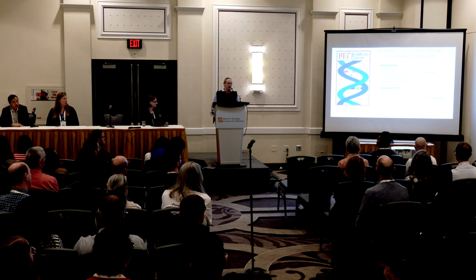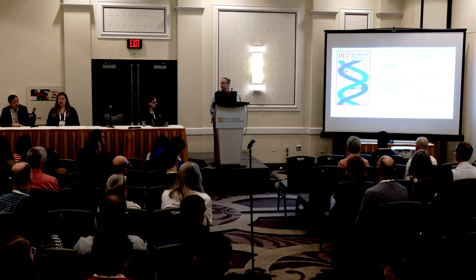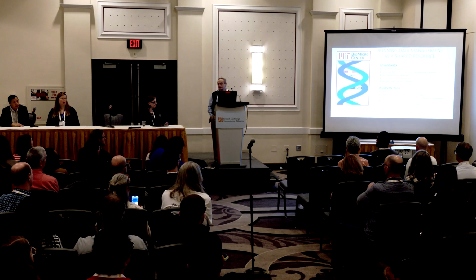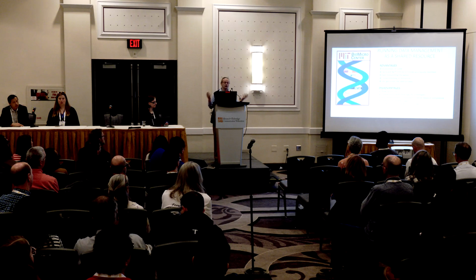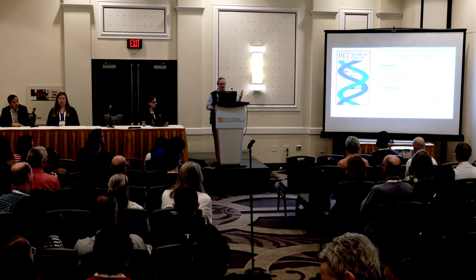Just quickly, again, we are a data management core. So what does it mean to be a data management core? There are some advantages, economies of scale. It's the same tool we're using for all of these platforms. The skills are not critical as a future faculty member. As a bioinformatics core, this is a challenge for us normally, because if we're doing somebody's analysis for them, that makes them a less good candidate for their next job. But that's not true for data management. We can do it for them, and it's okay. It's okay to have some bread and butter here. We're not reinventing the wheel every time.